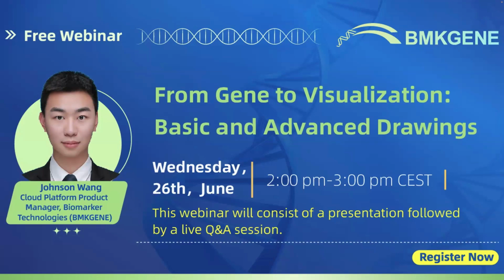In this session, we will cover three main topics to help you make the most of our cloud platform's capabilities. First, one-step drawing. Discover the simplicity of creating visual representations of your gene data with just a few clicks. Second, advanced drawing tools. In the case of cluster heat map, dive deeper into our advanced drawing tools using cluster heat maps as a case study. And third, interactive filtering and plotting, COG bar chart. Explore the interactive features of our platform with the COG bar chart.